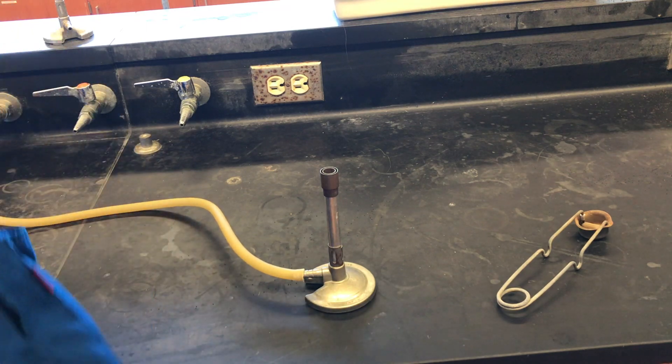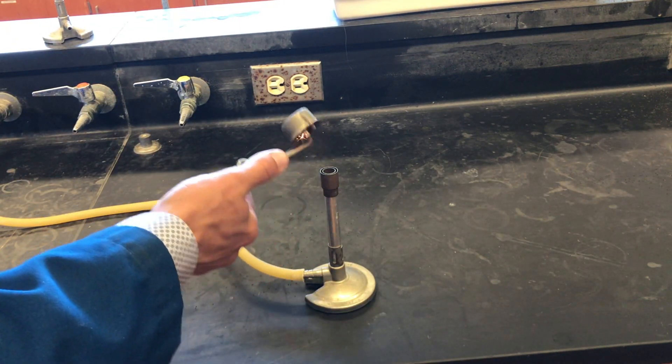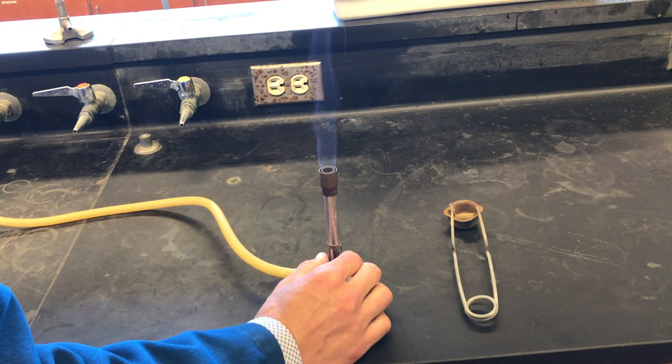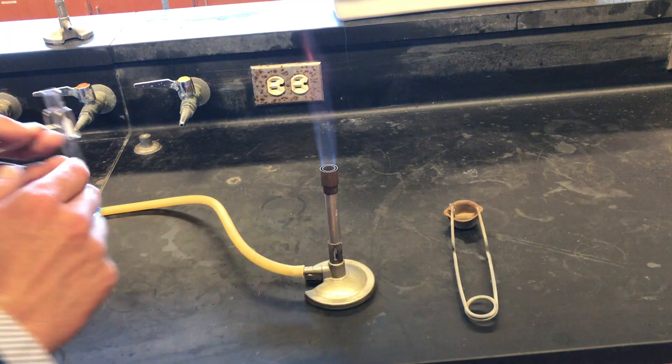To light the Bunsen burner, we'll close the oxygen valve at the bottom and turn on the natural gas. Use the striker to light the Bunsen burner and then carefully open the oxygen valve until we have a blue cone of flame with no orange in it.